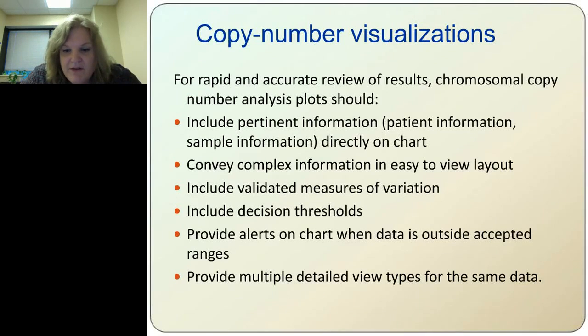So for copy number visualizations, I want to go a little bit into visualizations. Unfortunately, I'm not going to have a lot of time to go completely into visualization like I wanted to in my abstract. But there's certain things in our LIMS system when it came out with reports and for quality control measures. Our copy number visualizations had to be accurate to produce rapid and accurate review of results.